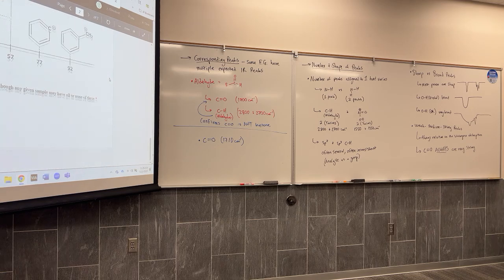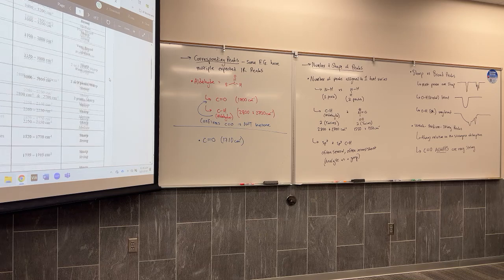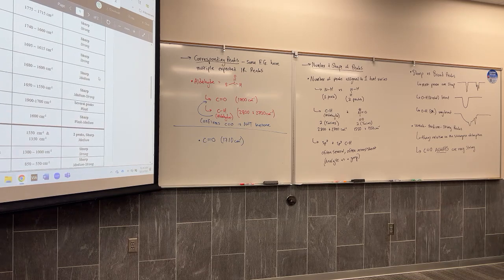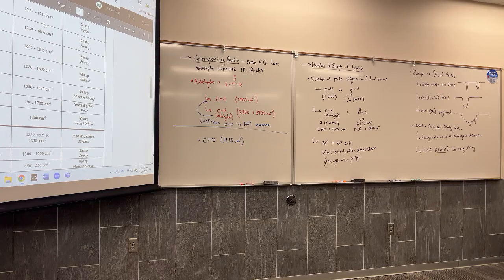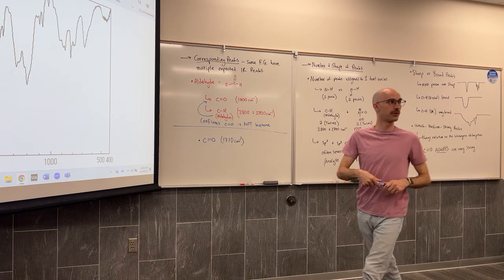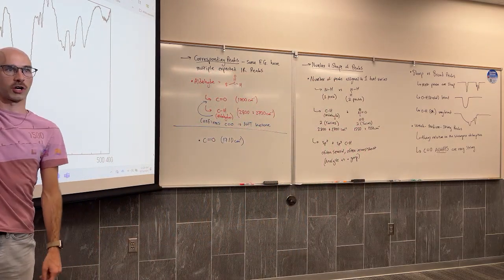No, that's because it's down here as well. I don't know why it says ester shows up 4 times. I'm seeing it twice. If it's an ester, I would have a corresponding peak down here in my fingerprint region. But when I look back at my structure, I do see the very broad absorption of the carboxylic acid.